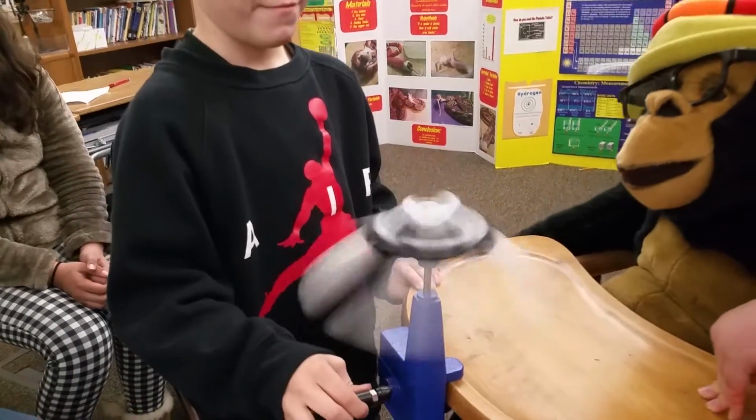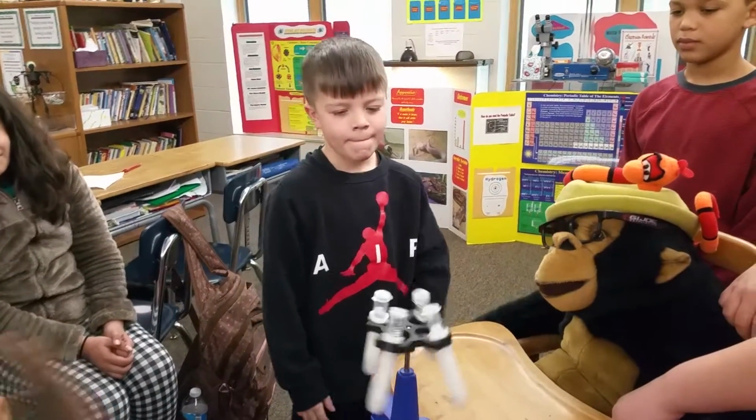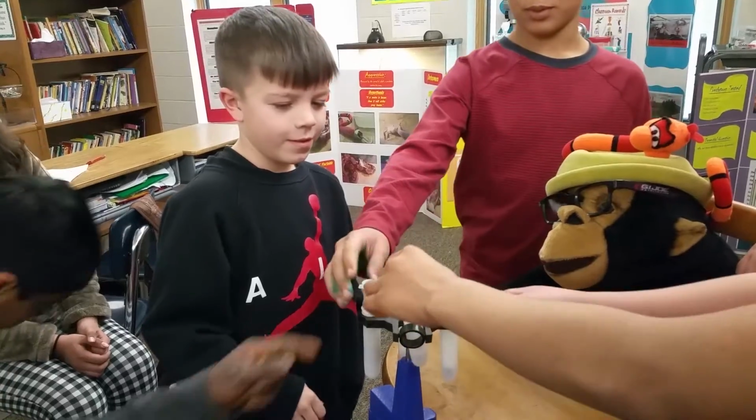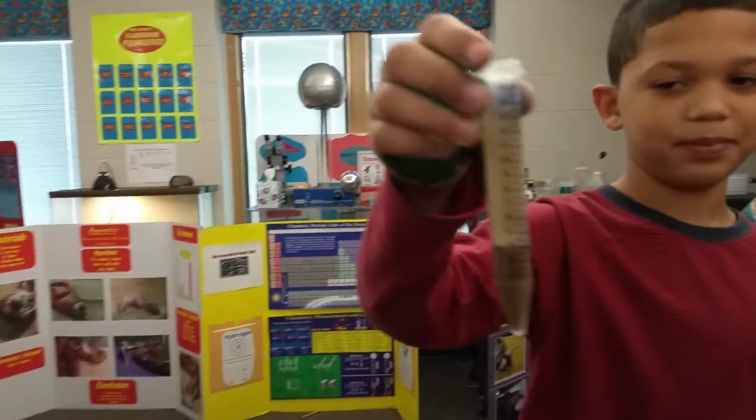Good, okay, stop. Wait for it to stop on its own, don't grab it. Okay, now, slowly take out your test tube and you should see your denser particles, the sand, where? At the top or at the bottom? Oh, hold that up, Jalen. All the denser particles are down there at the bottom.